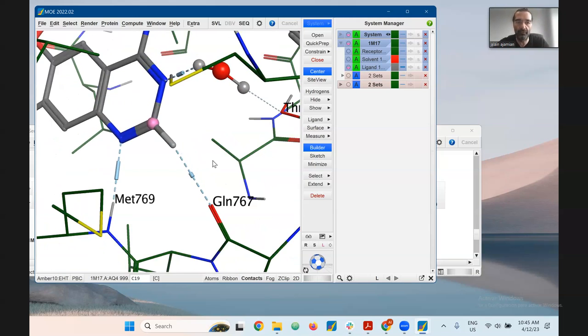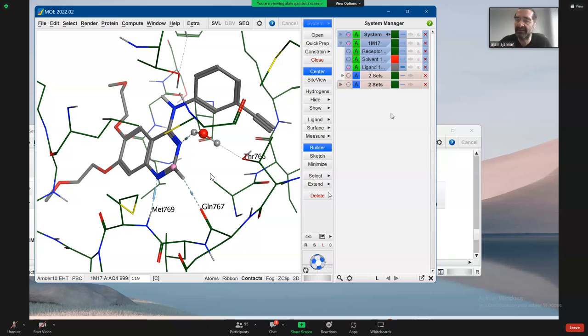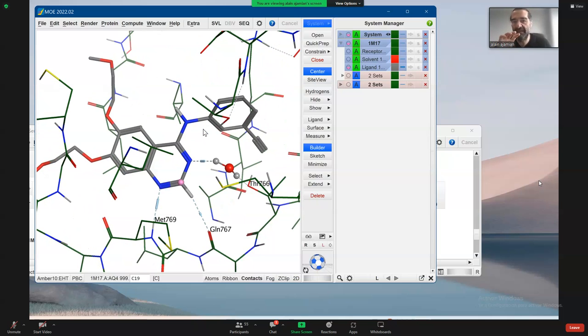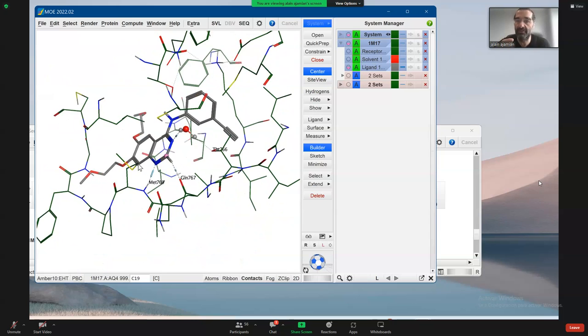So this is a straightforward way of visualizing the hydrogen bonding interactions and arene type of interactions. If you had a hydrogen arene interaction present, you would be able to visualize it. Right now, in this given example, we don't have that. This is quite a simple system, and visualizing the hydrogen bonding or polar interactions is quite easy. There are just these three interactions. But sometimes, when you have a macrocycle or a peptide, you'll have many more interactions, and visualizing within a 3D environment becomes quite difficult.